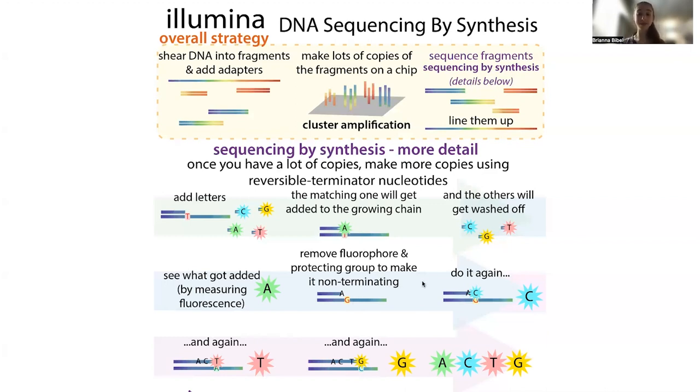The actual technology for this is always changing, so that they're able to measure multiple letters at once, with various dye technologies that are making it more efficient and more accurate. So check out Illumina's details. I'm not even going to try to go into them because they're constantly changing and evolving and getting better, and it's a complicated dye chemistry. But the basic idea is that you're doing this sequencing by synthesis, where you're reading out the DNA as it's getting made, directly.